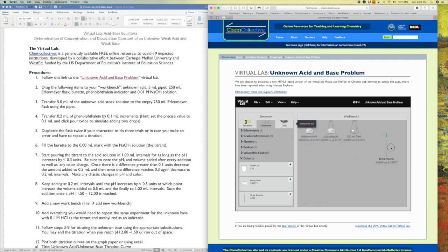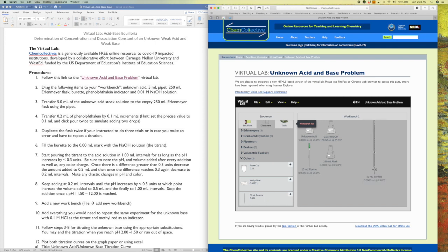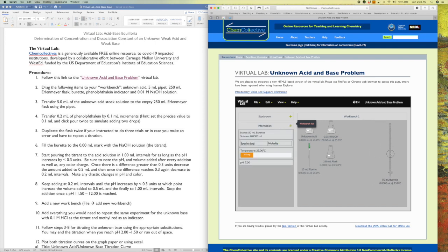Nope. See, I probably should have left well enough alone. Let me see. So you see, it just takes some fooling around and rearranging with your bench top, but eventually it will work out.